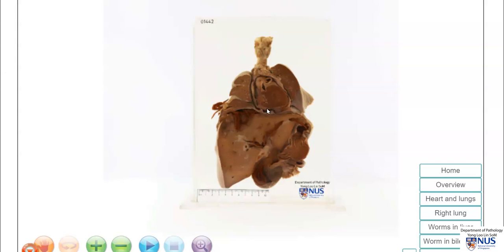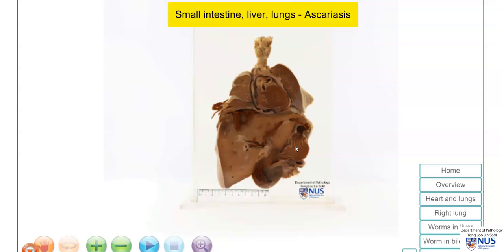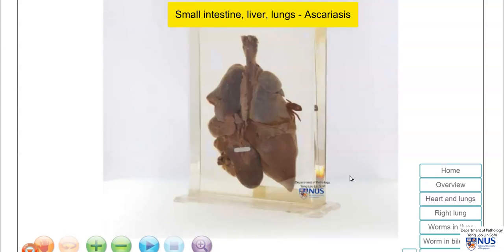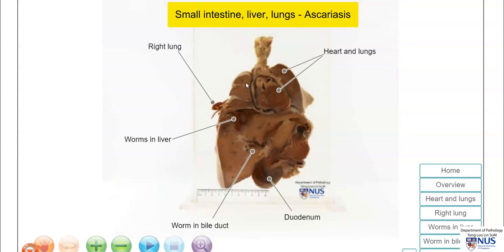Hello, this is a virtual pathology specimen of a case of Ascariasis, or Ascaris lumbricoides infection, involving multiple sites. We see here a complex specimen — let's have a look at the labels. We have the lungs, the heart, this is the liver, and this is part of the duodenum and the stomach.